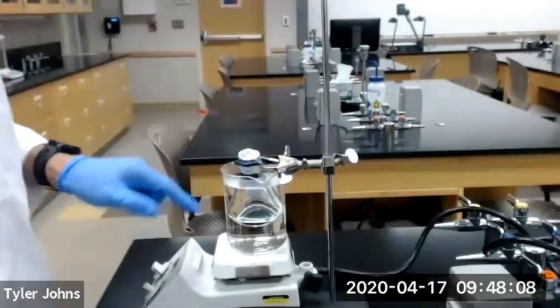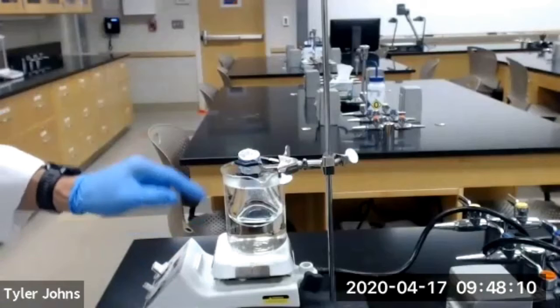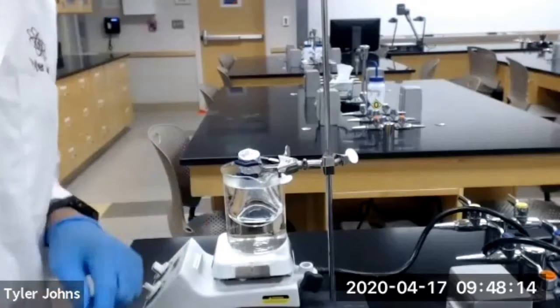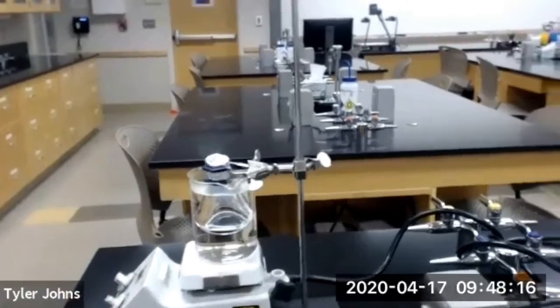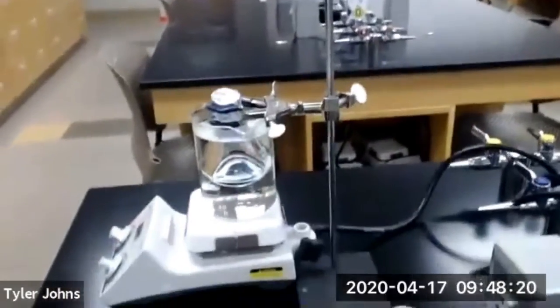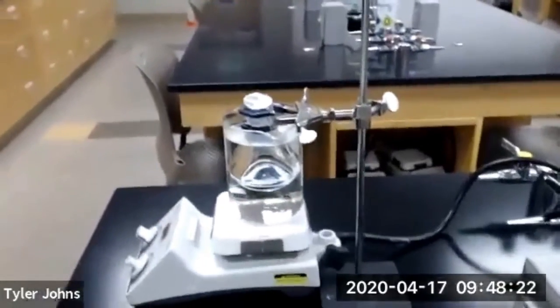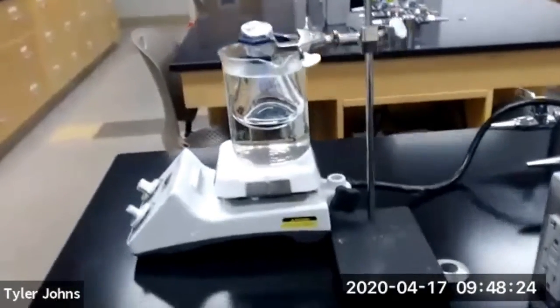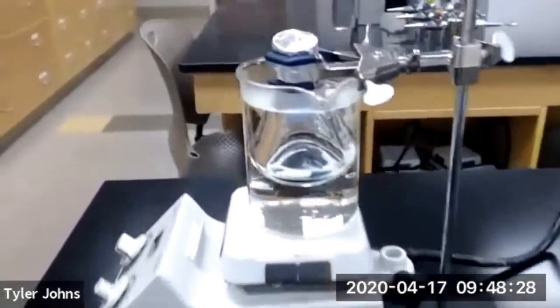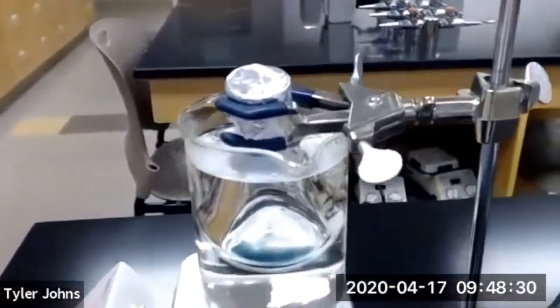For today's experiment, we're going to be assuming that our boiling water is exactly 100 degrees Celsius. So now we need to watch for when the volatile liquid no longer remains in the Erlenmeyer flask, and we will need to remove that Erlenmeyer flask from the boiling water.